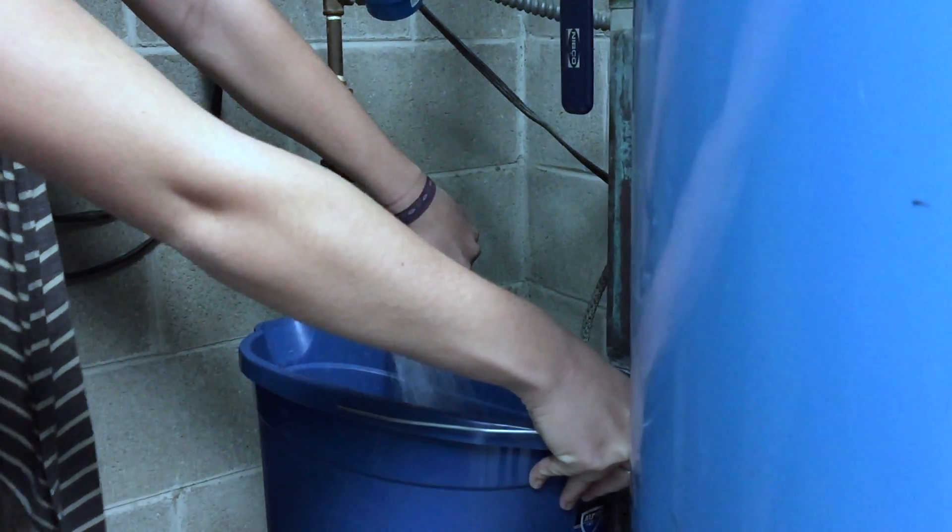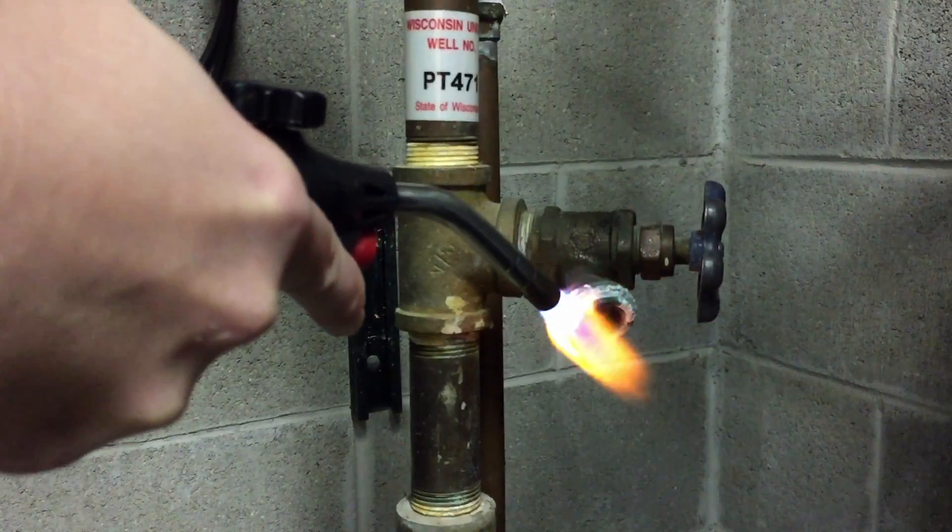You want to go to your pressure tank, which is usually in the basement. There's a faucet right next to it. You'll turn that on for about five minutes with a bucket underneath catching the water, of course.